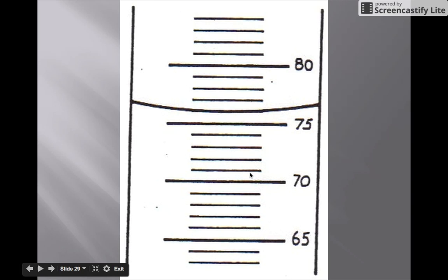This one's interesting. Remember, every line is something point something because the way that the intervals are set up, we can estimate to the 10th place. So if this is 75, then this is 76. But because it's right on the line, we still describe it as 76.0.